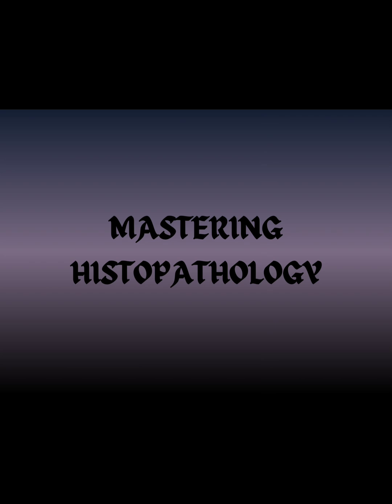Today we'll be talking about the steps from the point we receive the tissue specimen up until microtomy. So without wasting much of your time, let's dive right into it.